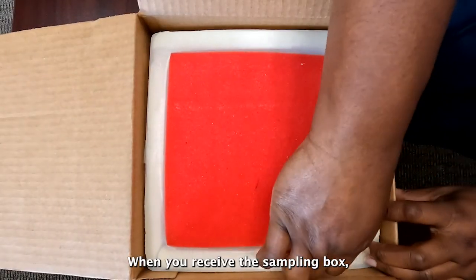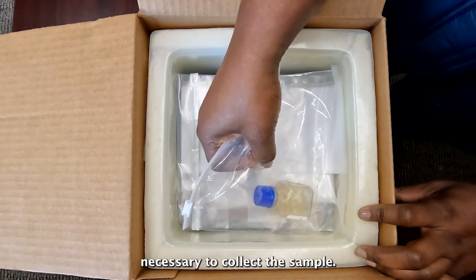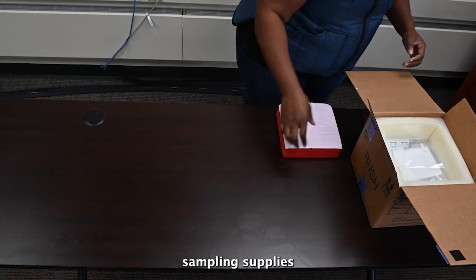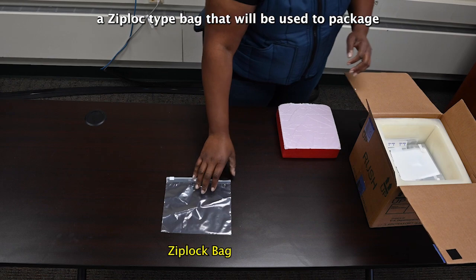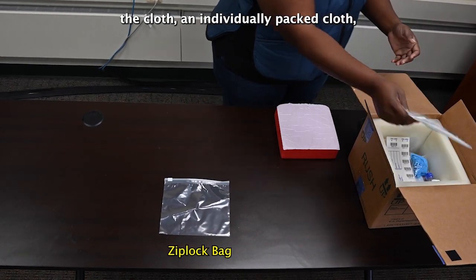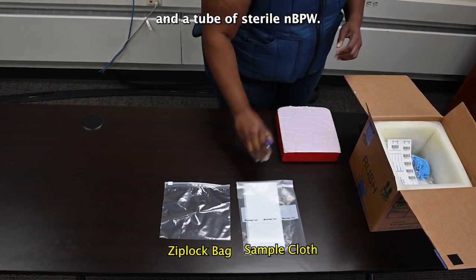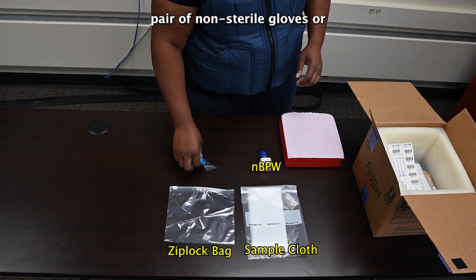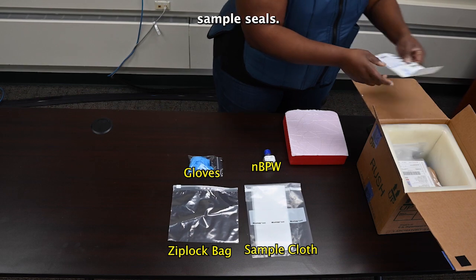When you receive the sampling box, verify that it contains all the supplies necessary to collect the sample. The box will include the following sampling supplies: a Ziploc-type bag that will be used to package the cloth, an individually packed cloth, a tube of sterile NBPW, and one pair of non-sterile gloves, and a set of FSIS sample seals.